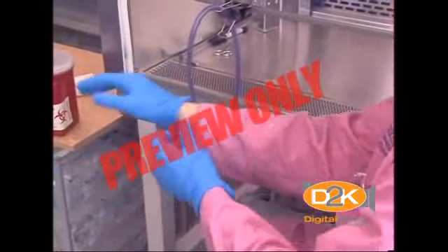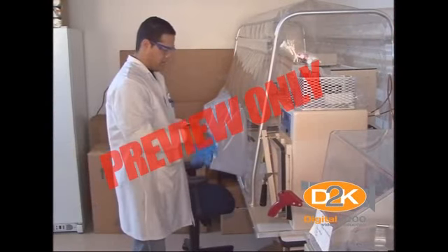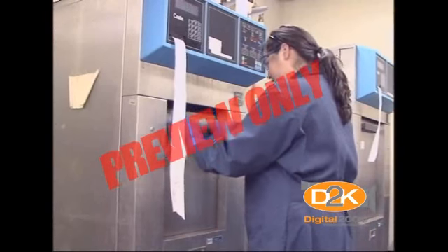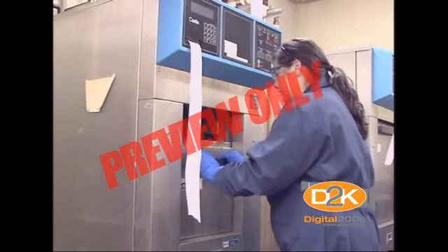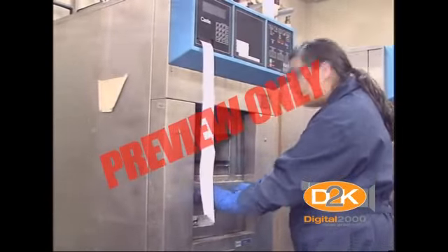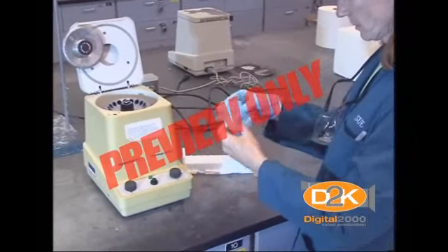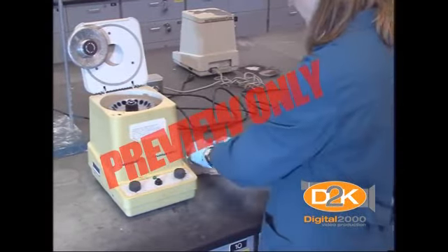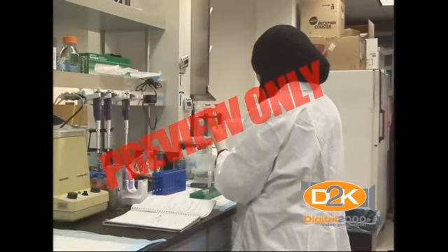Gloves can protect your hands from a variety of hazardous substances. They are great tools, but they work best when they are used properly. The saying, "the right tool for the right job," is the same for gloves. The right glove for the right job. There are many types of gloves, but probably the most used and possibly misused is the natural rubber latex, NRL, glove. They are readily available and relatively cheap.